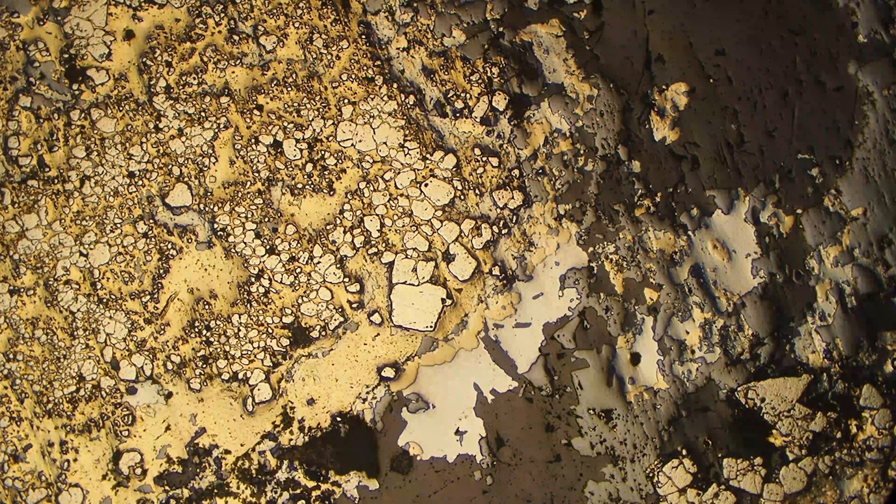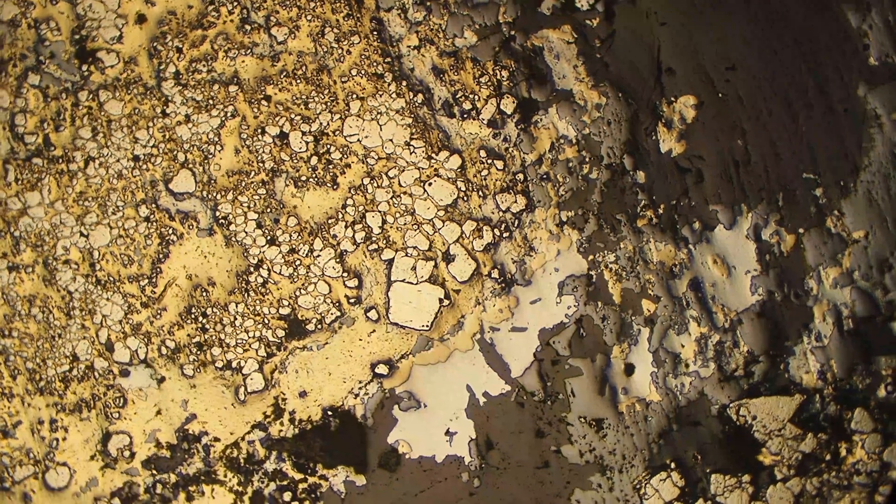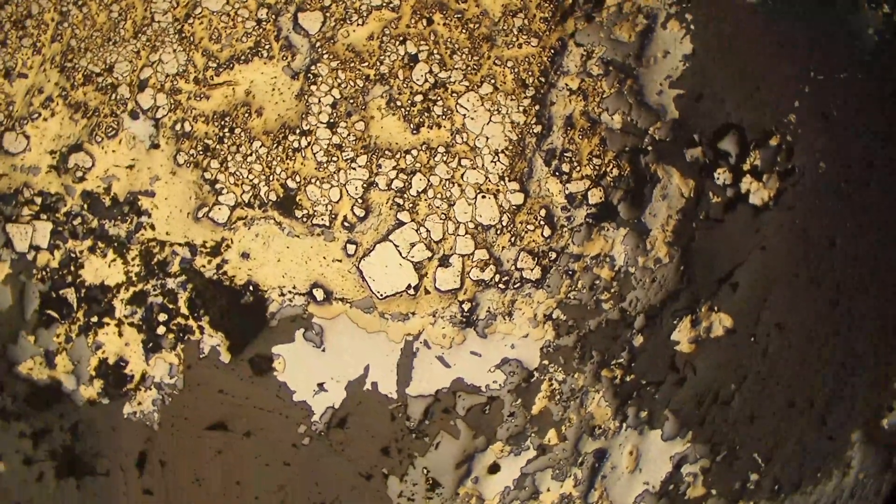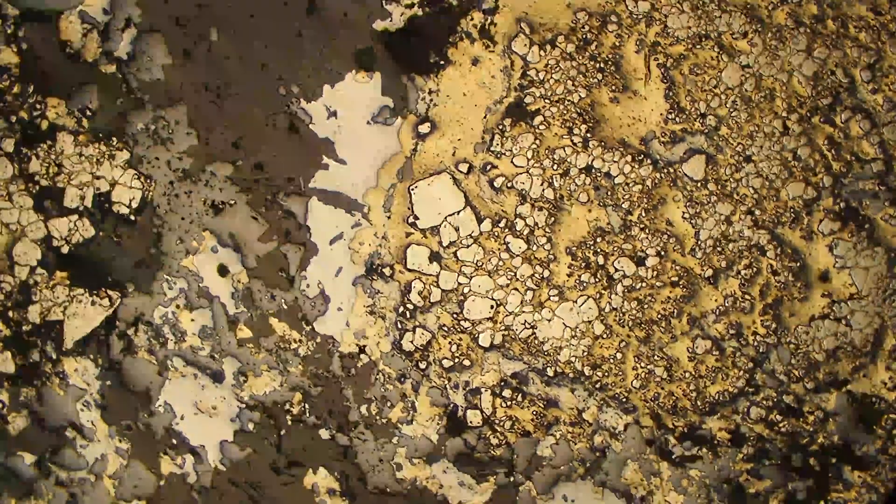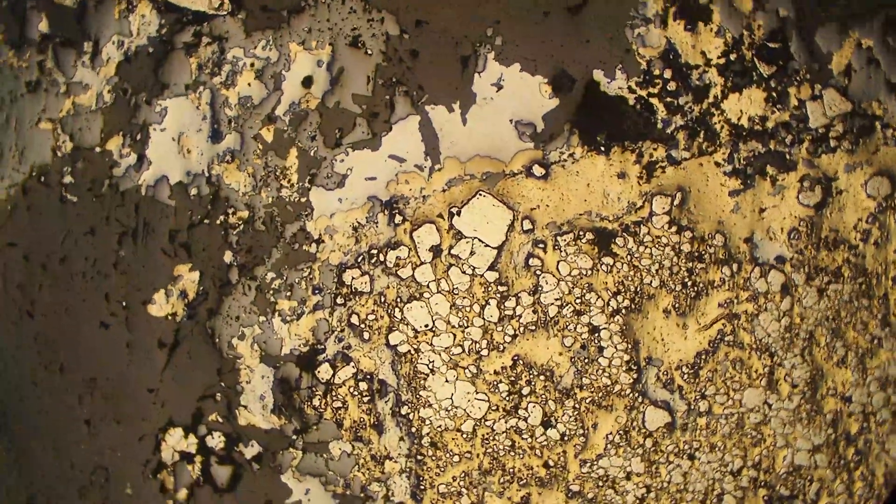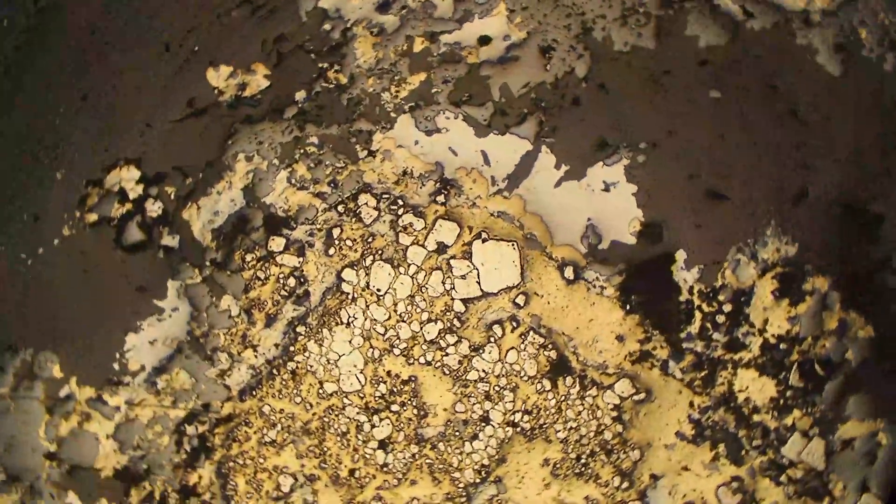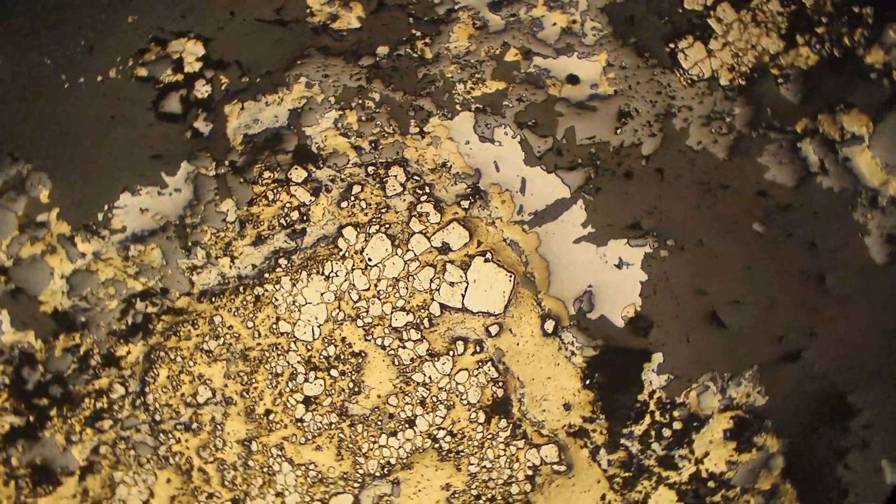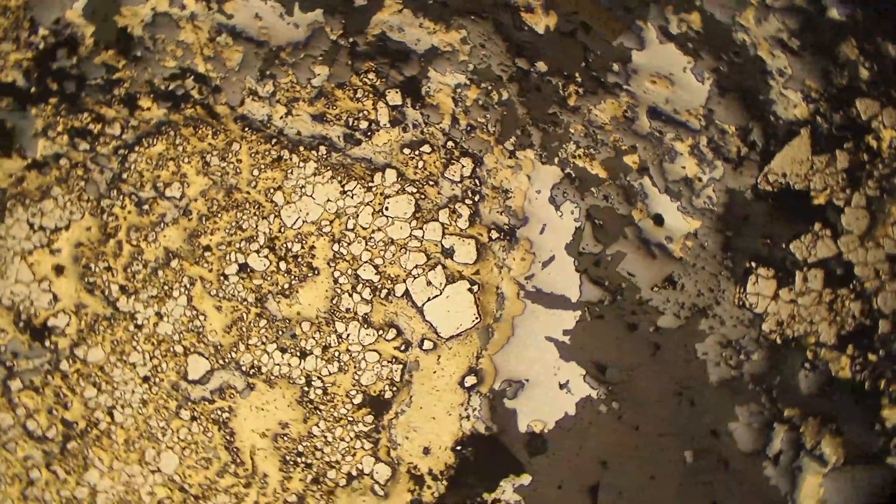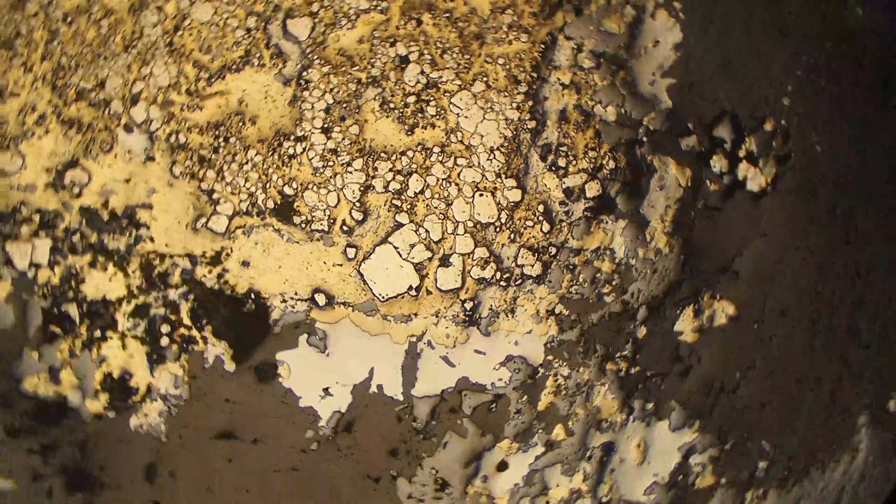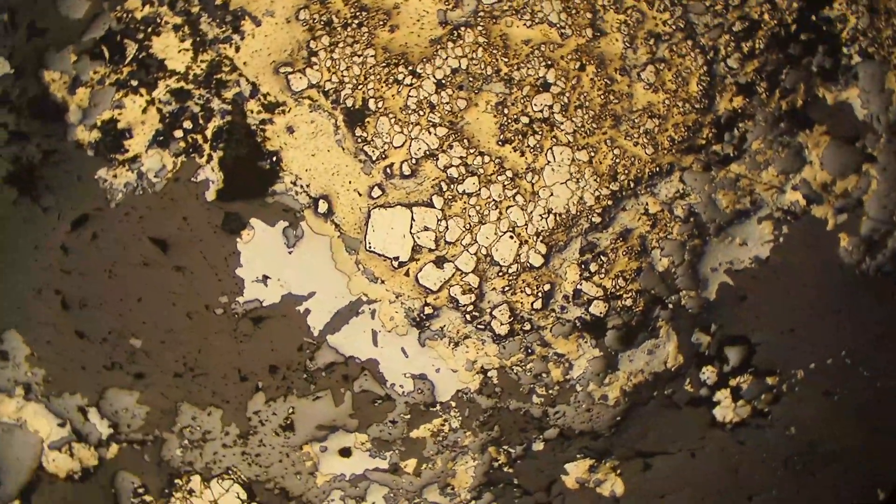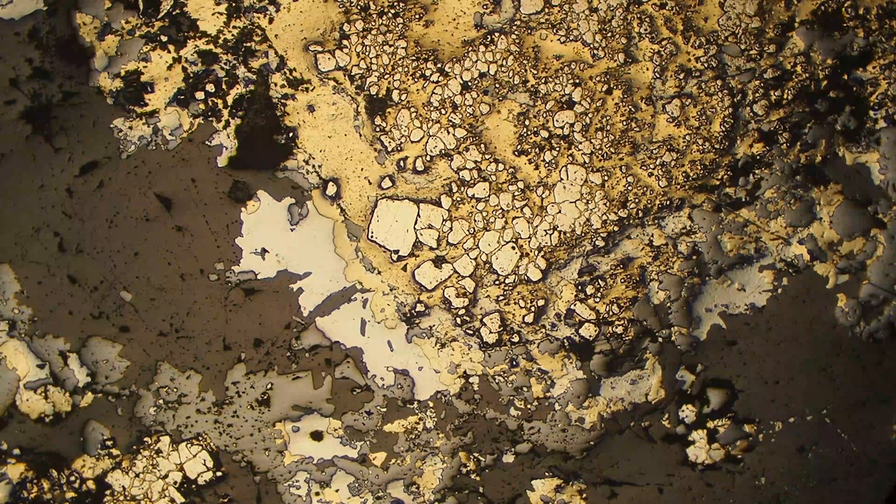What we can see here is the yellow of chalcopyrite sitting above a number of crystals of lighter yellow pyrite. Pyrite is harder, so it sits above the chalcopyrite, or it looks like it projects above it because it's less polished. And then in the gray we have galena, which is softer, and the chalcopyrite sits above the galena.